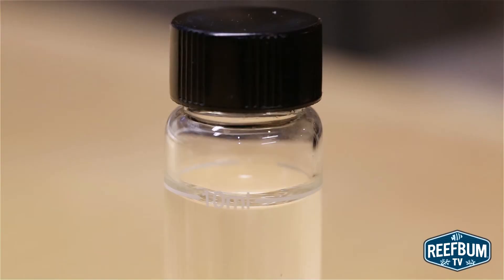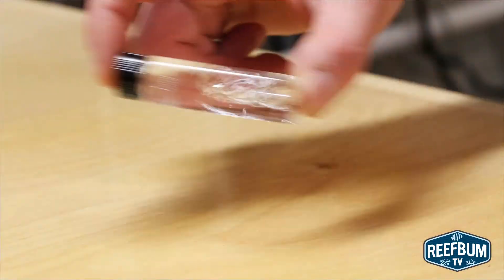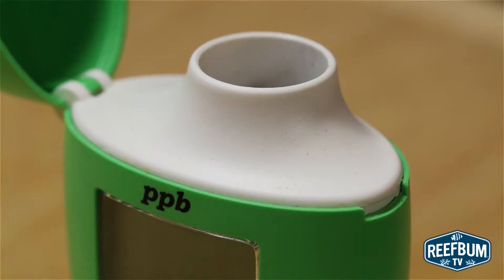Make sure you don't create bubbles by shaking the vials too much. Avoid letting the sample with the reagent sit for too long in the vial before you put it in the meter. After adding the reagent, shake the vial gently for two minutes and then put it in the meter right away. If it is reacting for more than two minutes, you may get a higher reading since reaction time is longer.